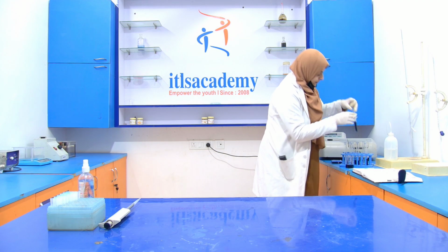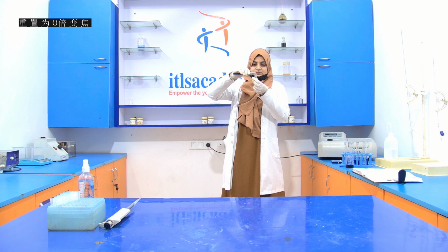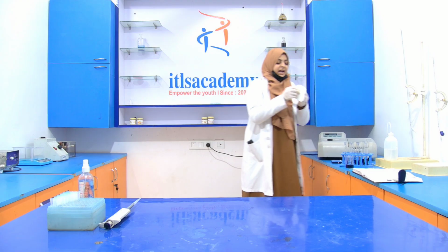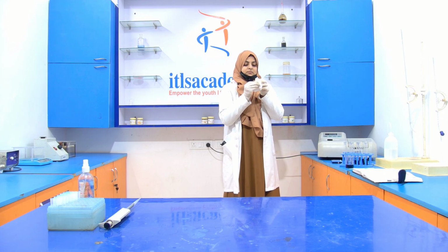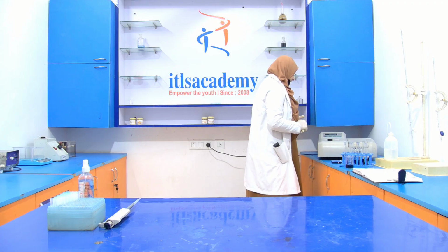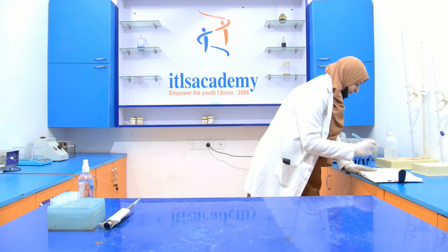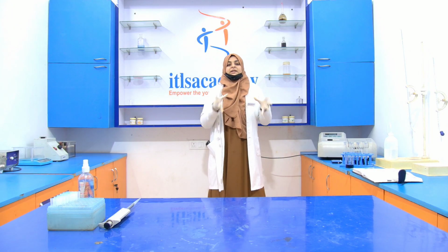Now take 1 ml. This is 1 ml of BSA. Again, wipe it with the help of that filter paper. Open the spectrophotometer. Put it into the machine and wait for the reading. Now this time we get the 0.140.